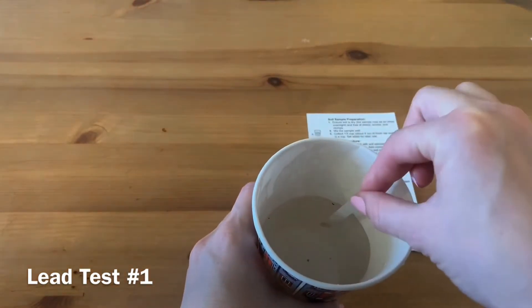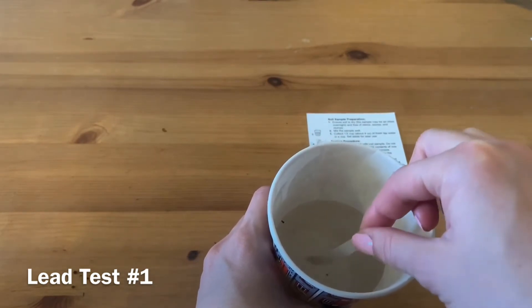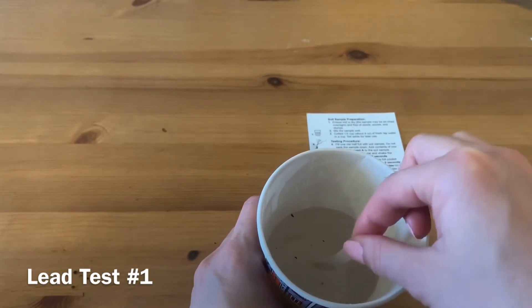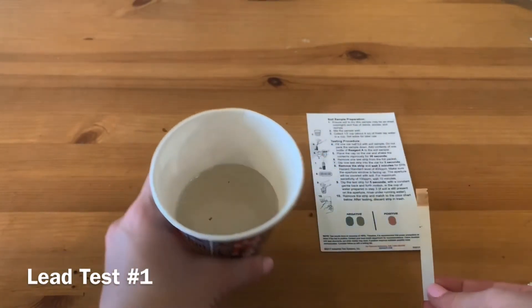After 10 minutes, dip the test chip for 5 seconds with a constant gentle back and forth motion in half a cup of fresh tap water. Remove the strip and match to the color chart below.